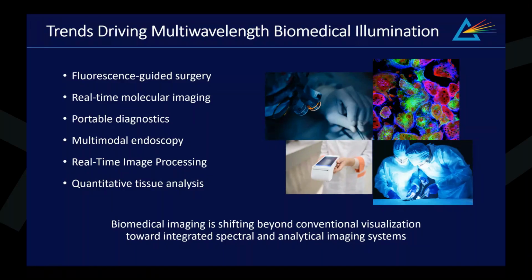Another important trend is the growing integration of compact and portable imaging systems for point-of-care diagnostics, minimally invasive procedures, and distributed healthcare applications. Advances in software-controlled illumination, detector technology, and real-time image processing are also enabling more dynamic imaging approaches in which illumination conditions can be optimized during acquisition depending on the imaging mode or analytic objective. More recently, AI-assisted imaging and computational imaging workflows are further increasing interest in spectrally programmable illumination systems capable of generating controlled and repeated imaging conditions for advanced imaging analysis.